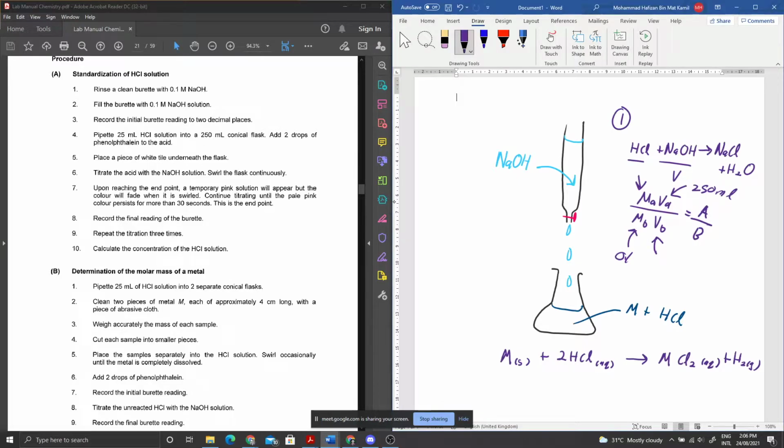how much we use for the phenolphthalein to change from colourless to pink, right? And then this one is the stoichiometric coefficient from the balanced equation. Check this equation whether it's balanced or not. So then, for the first step, which is standardization of hydrochloric acid, you will be able to find the molarity of HCl. So, you get how many moles.